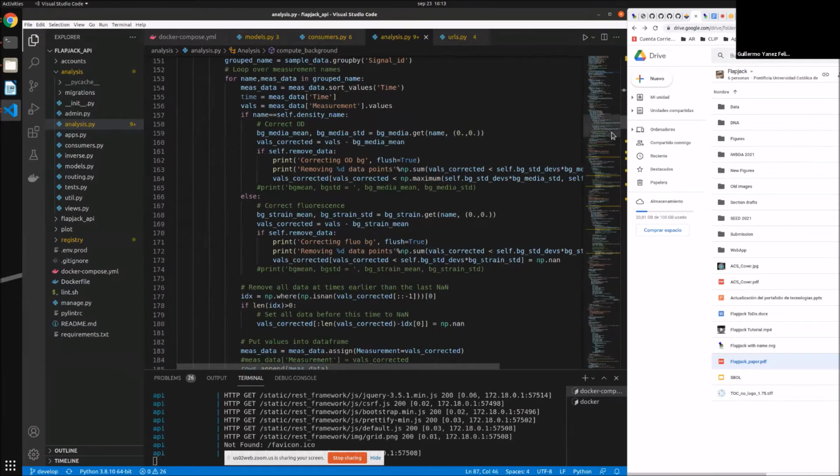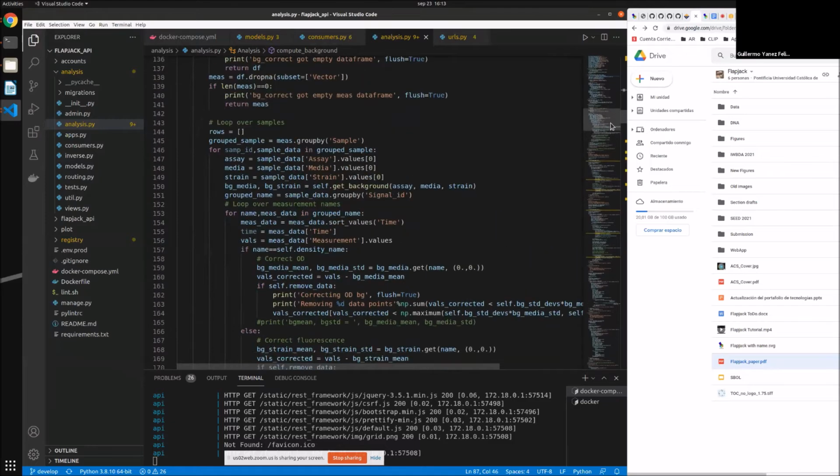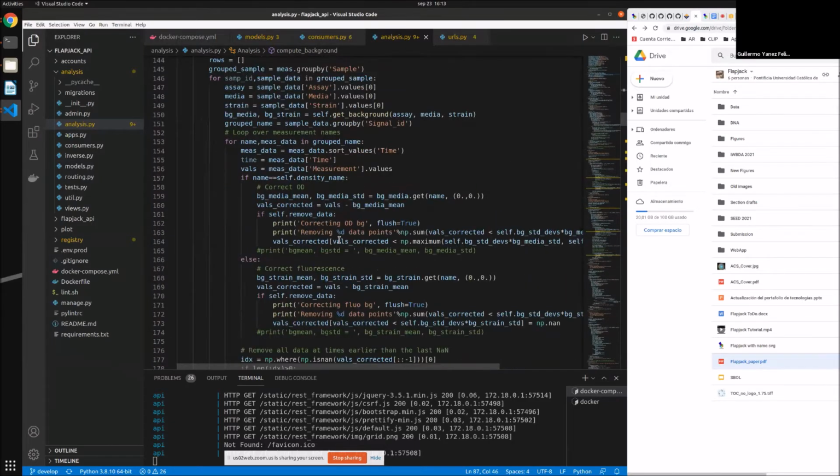So if you would like to add another type of analysis, this would be the way, like adding some kind of module or a superclass or, I don't know, we were thinking on inheritance of classes, something like that, or even drag and drop modules for the front end. Well, we have all kinds of ideas. The same in plot.